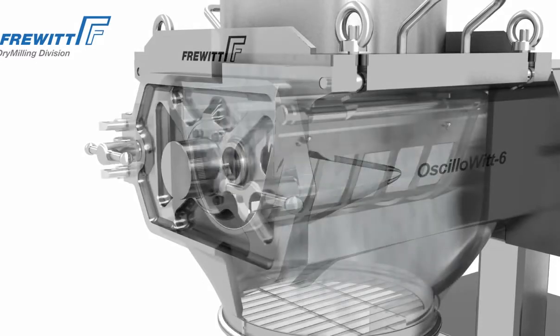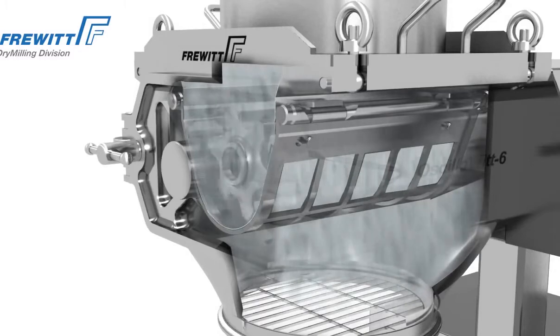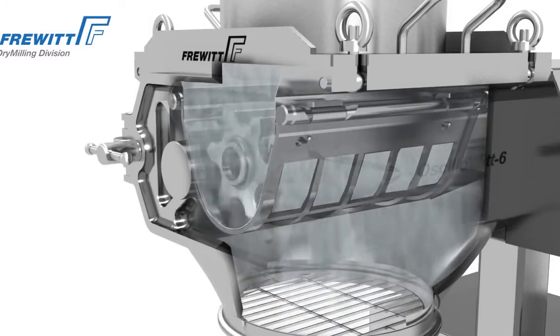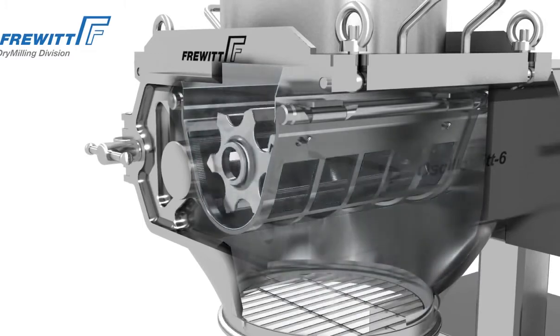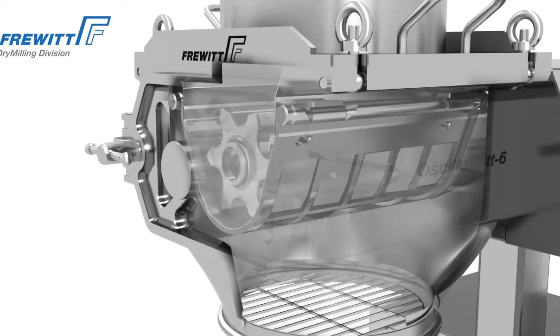The polished smooth surfaces of the Osillowit ensure the clean and residue-free throughput of the product. Plus, the Osillowit fulfills the criteria for WIP (wash in place), CIP cleaning, as well as SIP sterilization.